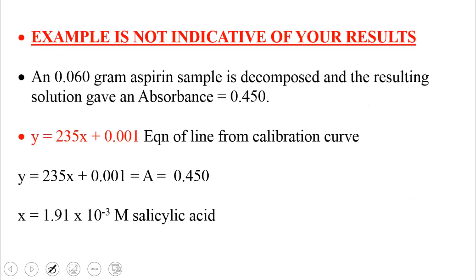So here is a sample calibration curve line. And again, it is not indicative of what you will get in class. So please do not compare this equation of the line to any that you would get in class, because again, I'm making this stuff up. If you are given this equation, remember Y is the absorbance, X is the concentration of salicylic acid.